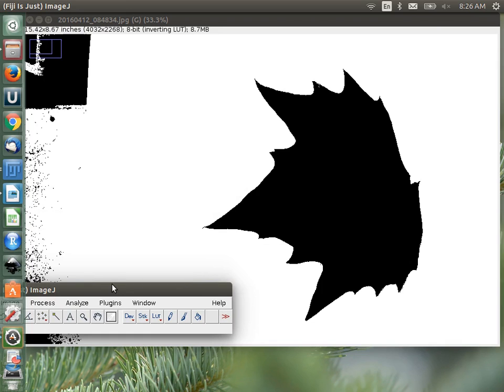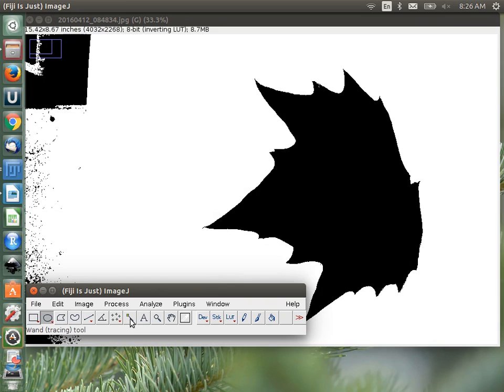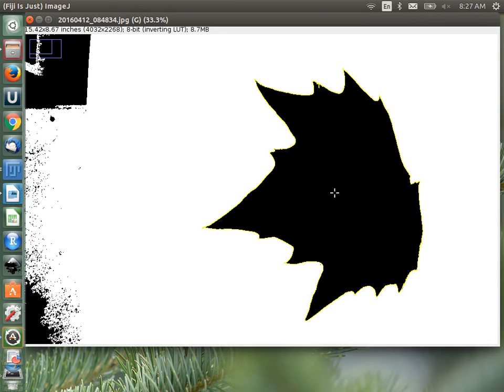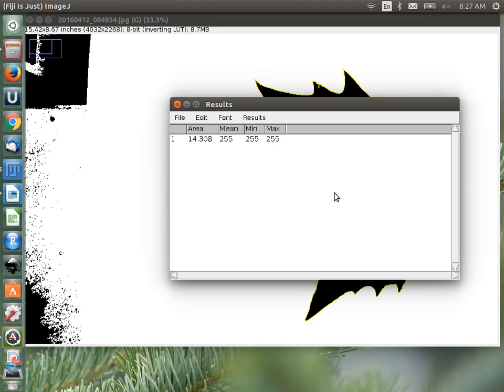Now there are a couple of ways to measure area. We can use the selection wand tool — the 8th tool in — which selects the connected region. Clicking on the leaf now shows the selection outline around the leaf. Hit Control-M to measure. When we did the circle it was about 25 square inches; we'd expect less. The actual area of the leaf is 14.308 square inches. This is a much easier way of measuring the area of a complex object.